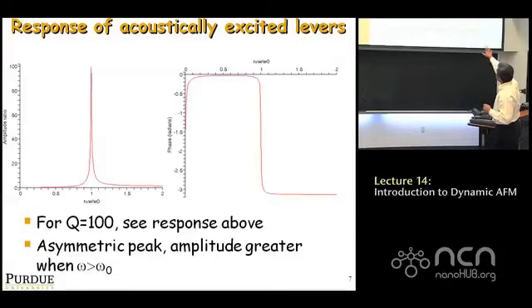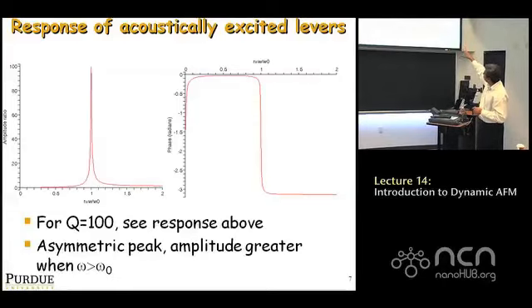This is the phase response. So this is phase that's negative, which means the phase lags. And you can show that when you're exactly at R equal to 1, the phase here corresponds to 1.5 radians or pi over 2 radians, which is 90 degrees, okay? So when you're exactly at resonance, the phase lag between drive and response is 90 degrees, okay? So two indicators are amplitude becomes very high and the phase becomes 90 degrees. These are the two indicators that your drive frequency equals natural frequency. But the cantilever always oscillates at the drive frequency, okay?